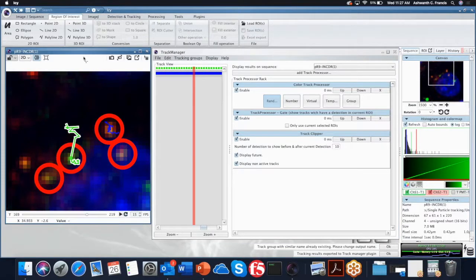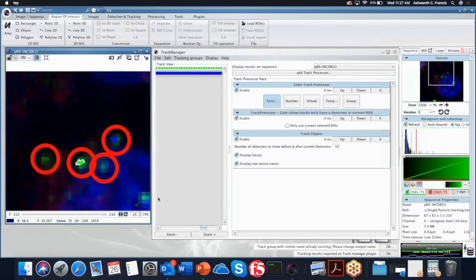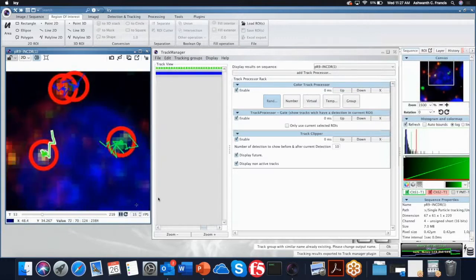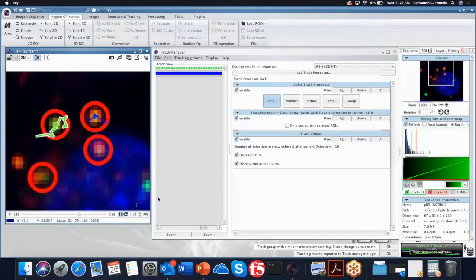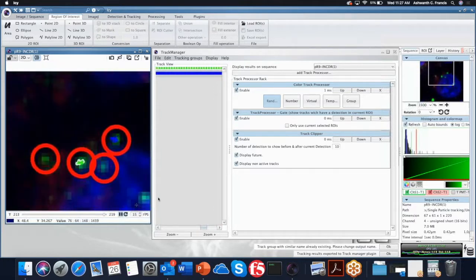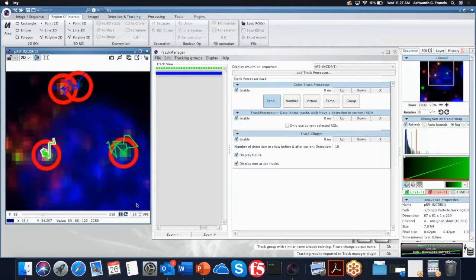This is another way to look at your tracks, right? You see that short segments of tracks are shown for your objects. When you have a crowded environment with plenty of tracks, you can follow a short segment of those tracks. You see how it works? This is another way you can check that this particle is actually moving on the right track. So you know the track of the particle.